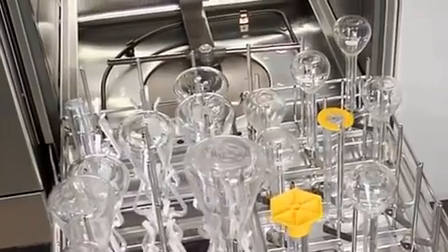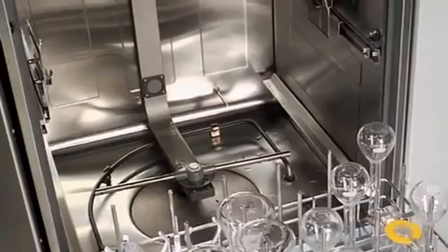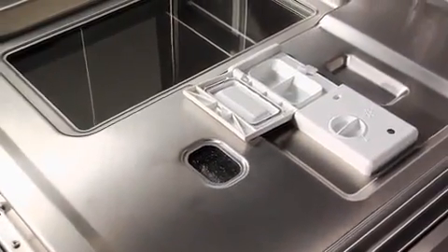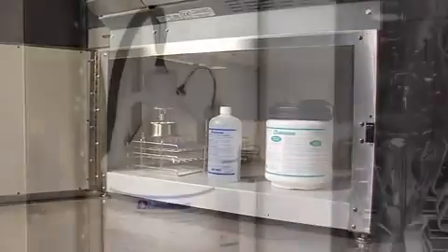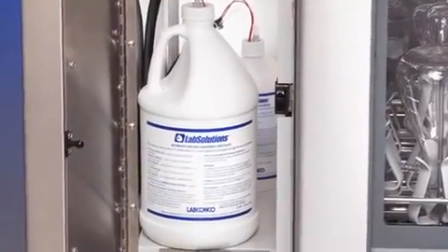A purified water pump is standard and allows the use of non-pressurized purified water. A steam generator produces hot water vapor to penetrate dried residue so detergent and hot water can clean effectively. A gasketed dispenser holds dry or liquid detergent. The Flask Scrubber Vantage also includes a liquid detergent dispenser with peristaltic pump and neutralizing acid rinse dispenser for hands-free dispensing.